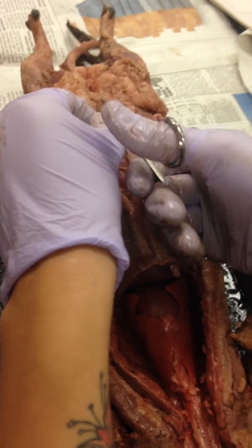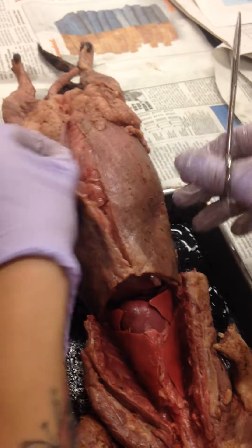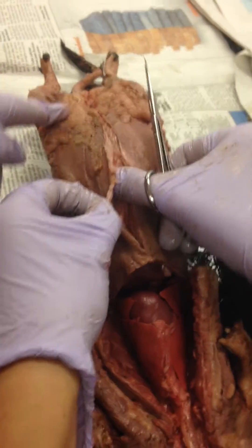I can see there's some fat under there. I'm going to cut all the way down. Is this all fat? Yeah, that's all fat too — so that's really just protection.